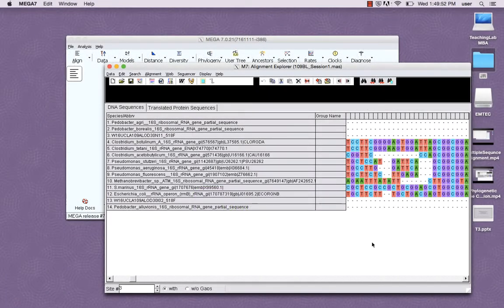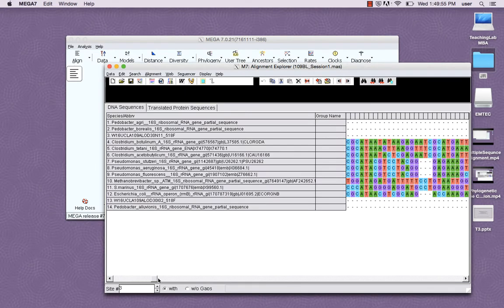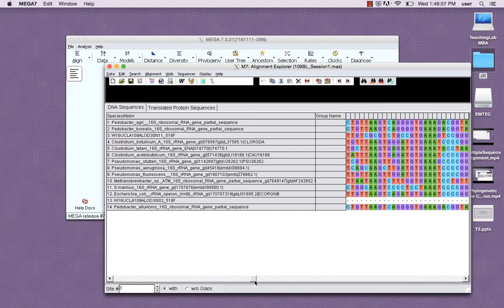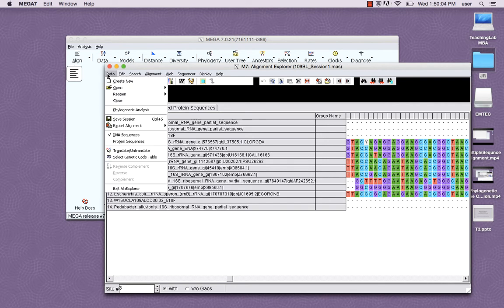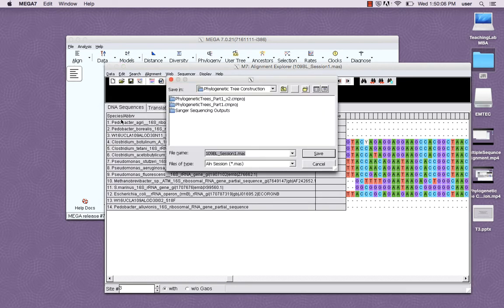To start, navigate to and open the last successful alignment session you've done in MEGA. Go to data, save session, and save this file with the proper name as an MAS file.